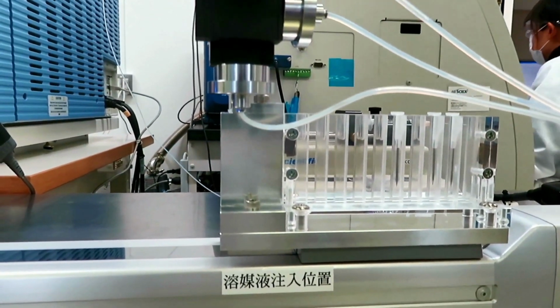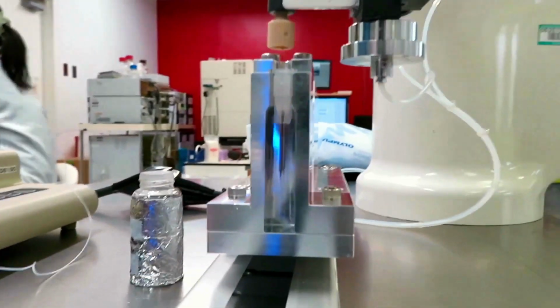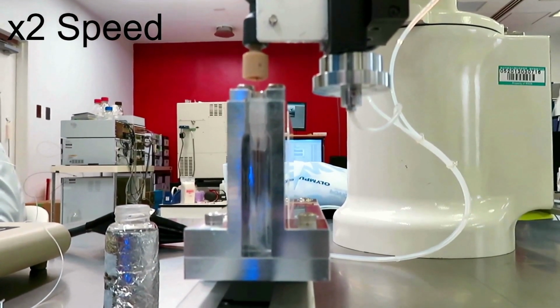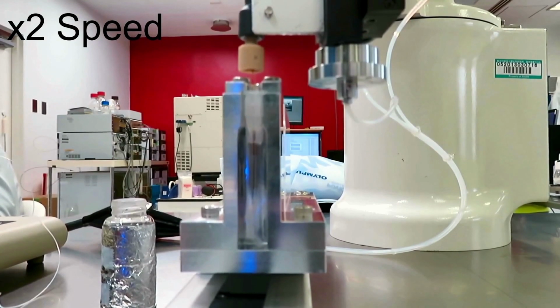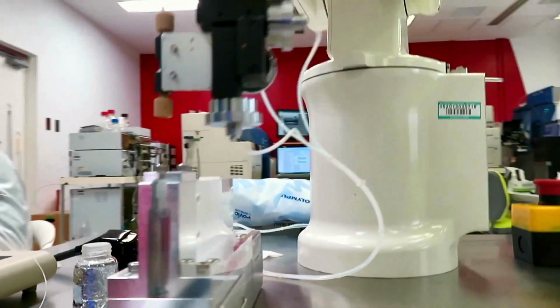So you have a very small capillary that goes inside our capillary and slowly pipettes the ionization solvent. It has to be glacially slow, because if we introduce any bubbles or air bubbles, that affects our nanospray performance later on, right? So this is why it's also very slow. I also sped this up.